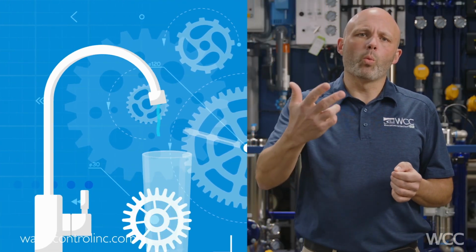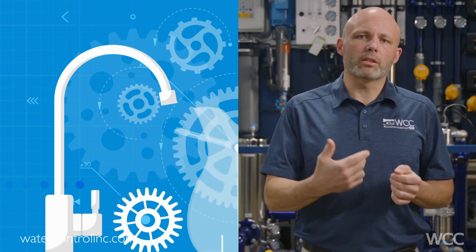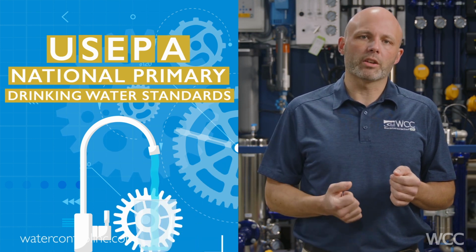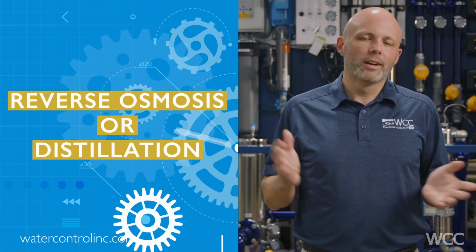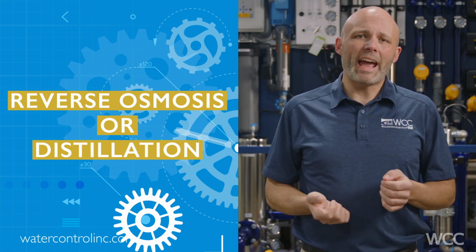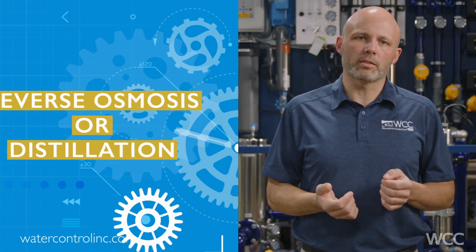Finally, if you're using water purification systems for drinking water, you'll want to make sure to meet the requirements of the US EPA's National Primary Drinking Water Standards. Now, in truth, if you use reverse osmosis or distillation to treat drinking water, you'll have no trouble meeting those standards. And most likely, you'll want to add some minerals back into the water for taste and pH balance reasons.